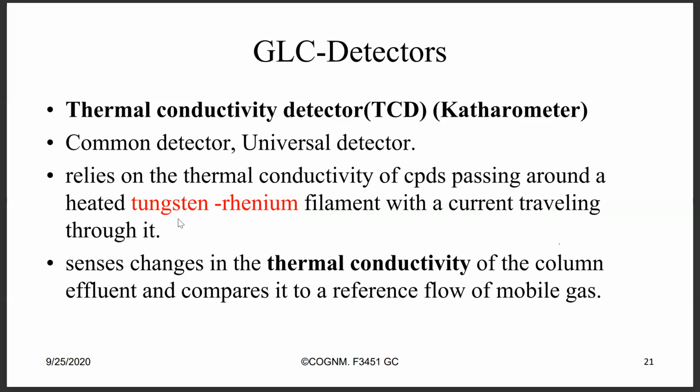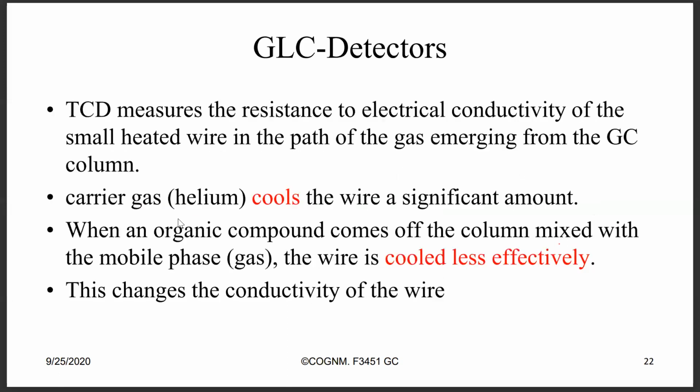Just understand that this detector is always receiving a current, and the conductivity is always the same, even when the mobile phase passes. However, immediately an analyte comes into contact, it changes the conductivity of our detector, and therefore it will then compare the conductivity at the time the analyte was present to the reference flow.